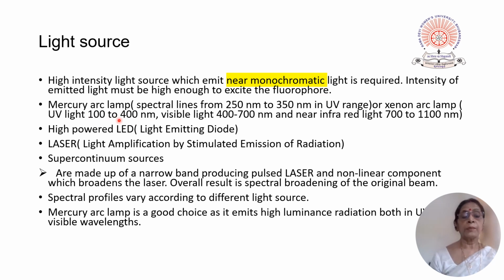Mercury arc lamp can be used, high powered LED can be used, laser light, supercontinuum sources may be used, but the mercury arc lamp is a very good choice because it emits high luminescence and it produces high luminance radiation both in the UV and visible wavelengths.